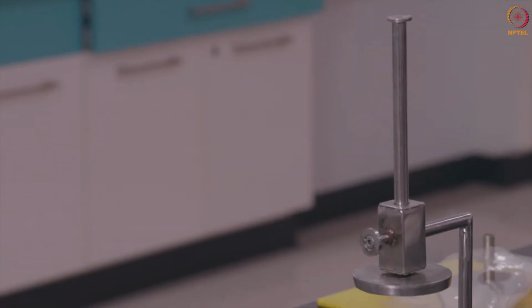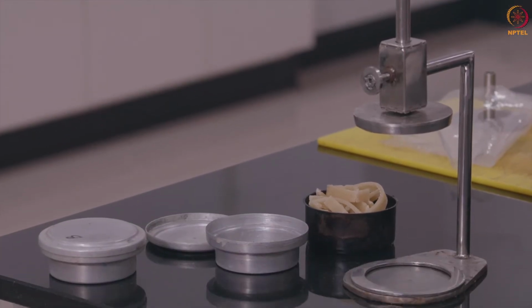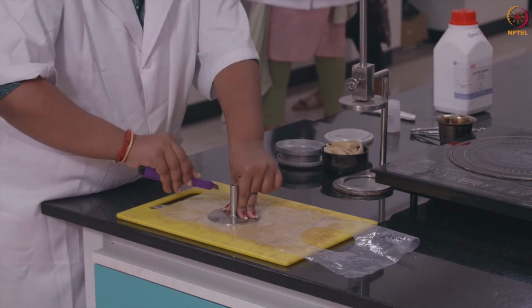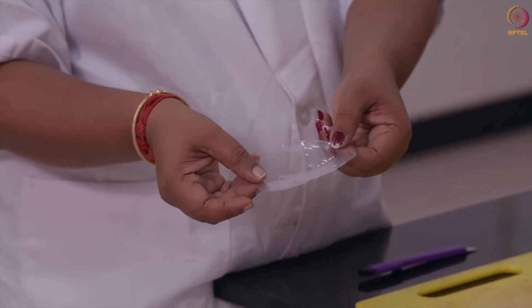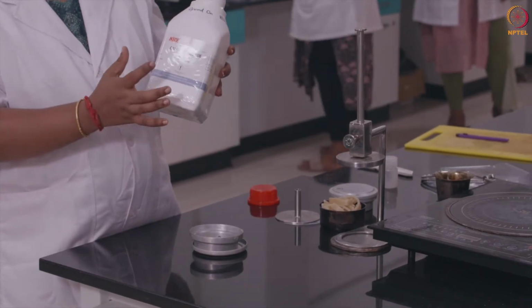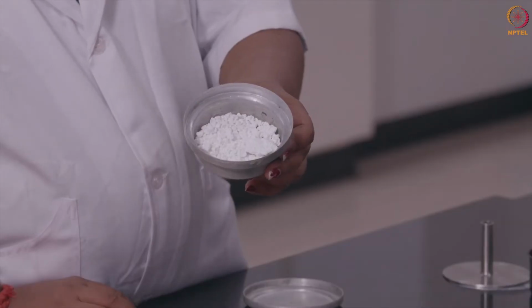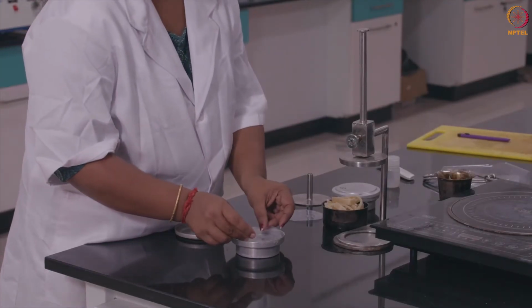Now, we will be doing the water vapor transmission rate of the packaging material by the conventional method based on gravimetry. WVTR, or water vapor transmission rate, measures the permeability of the packages to water vapor. We first cut the packaging material to the desired size. We take shallow aluminum dishes and add anhydrous calcium chloride, which is a desiccant. Cover the dish with the test film.